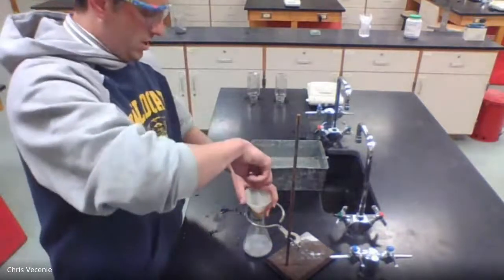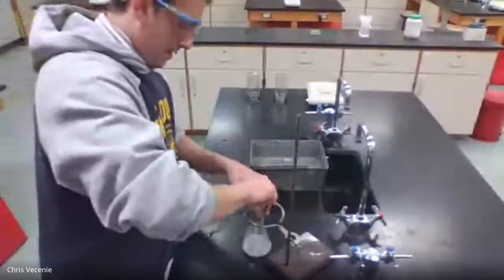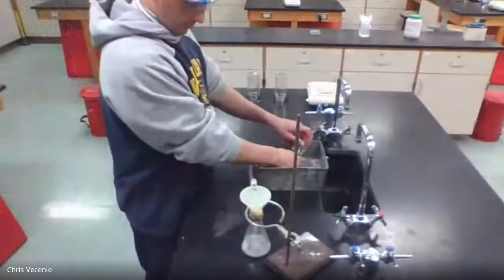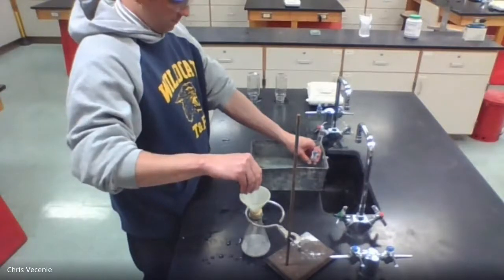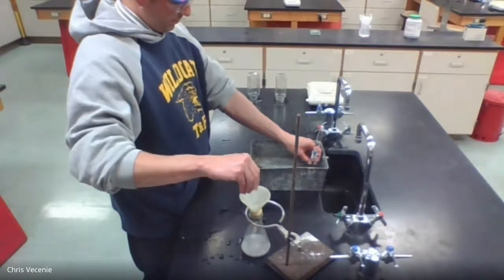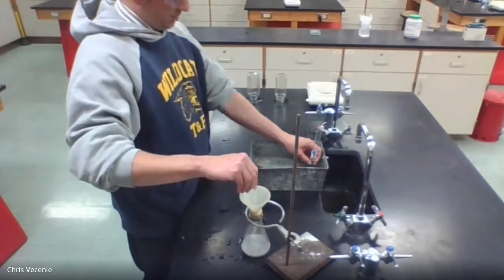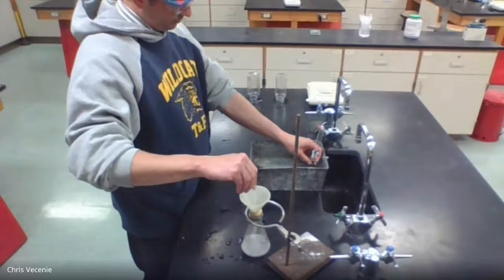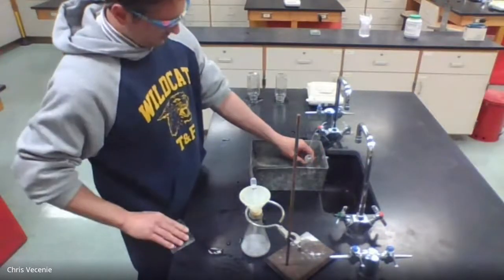So probably one pipette. And we'll see if there's any life left in this one. Doesn't look like it. So we'll go one more new pipette. This guy over here, and we'll inject. And the good news is the test tube fills very quickly by comparison. And cover that guy up. Set him over here.